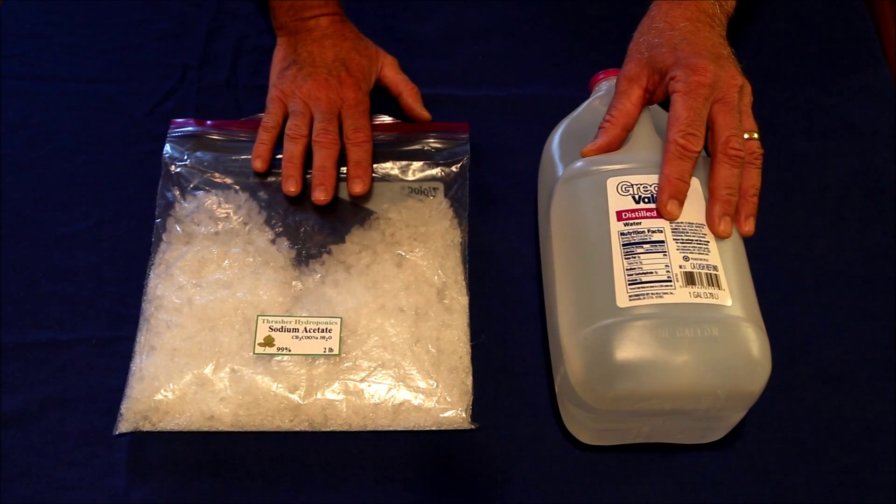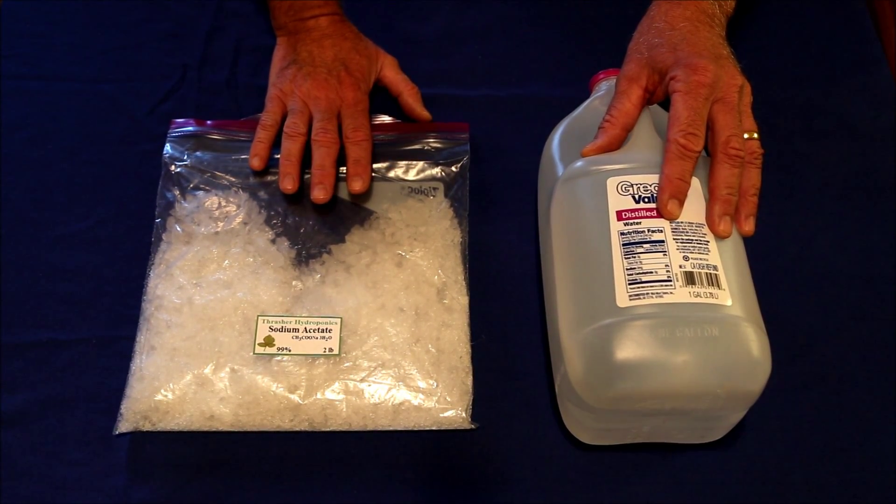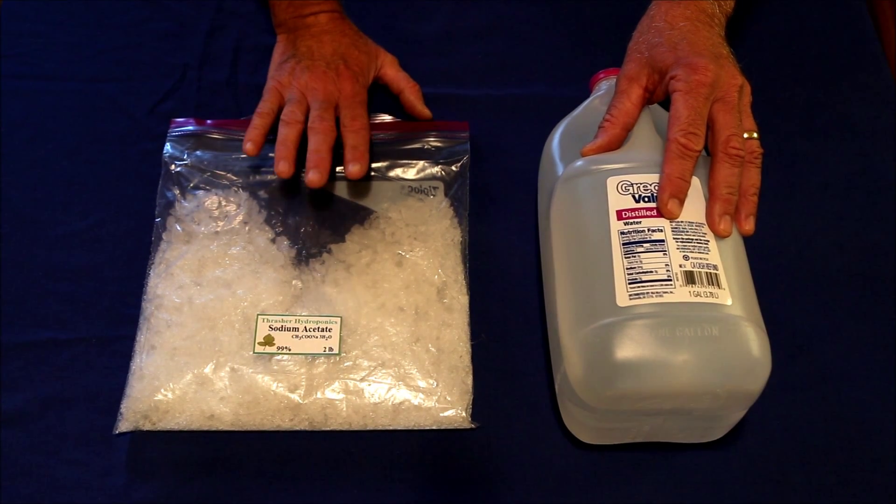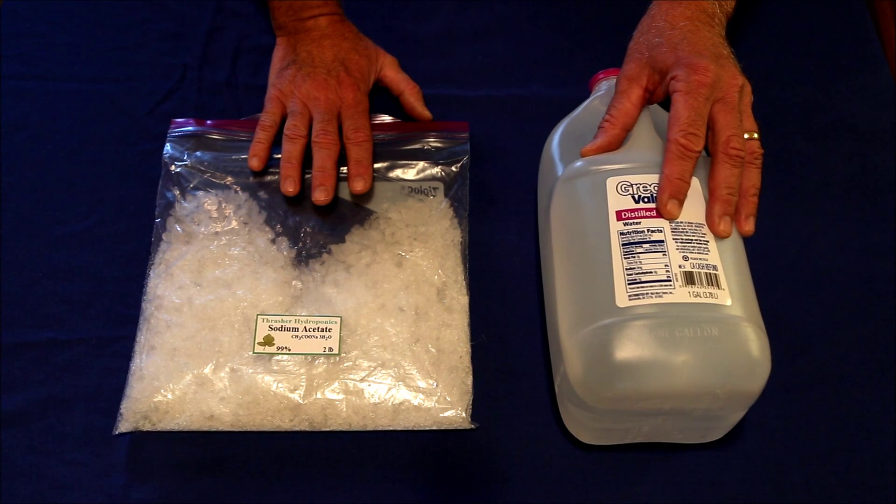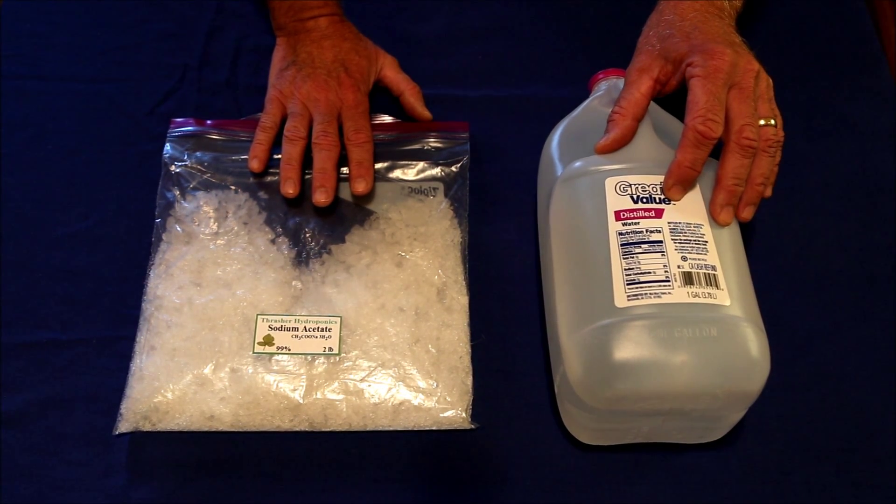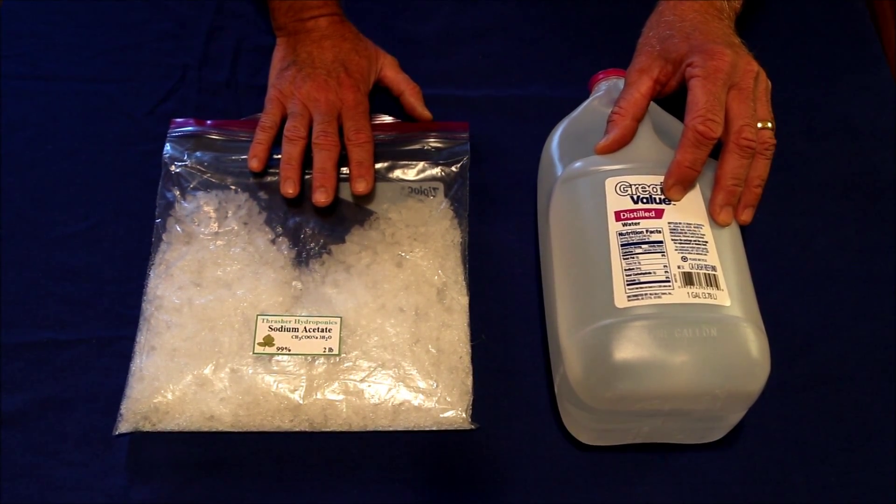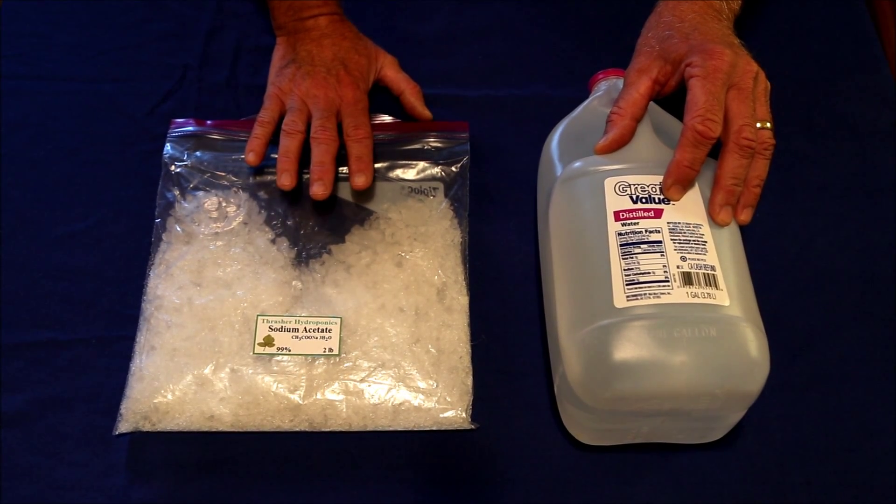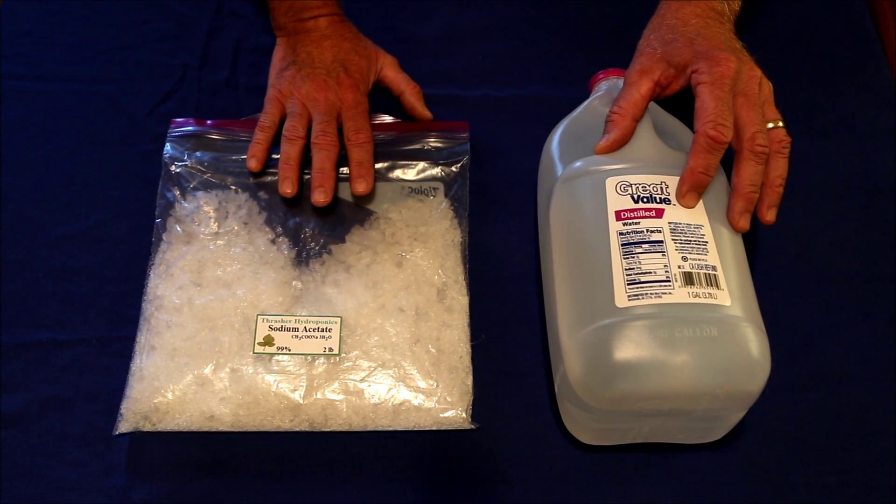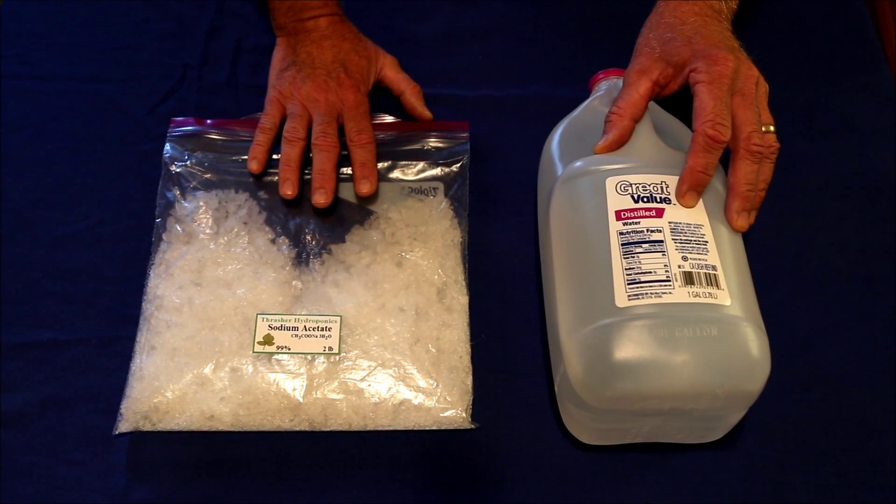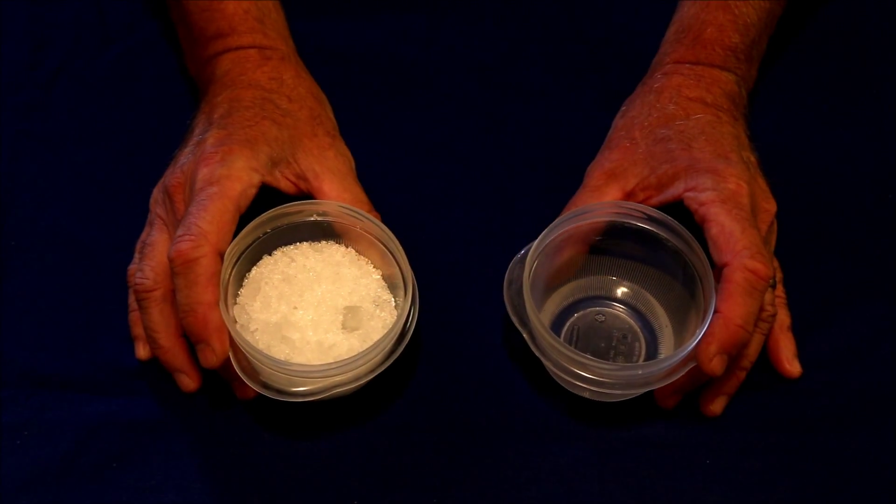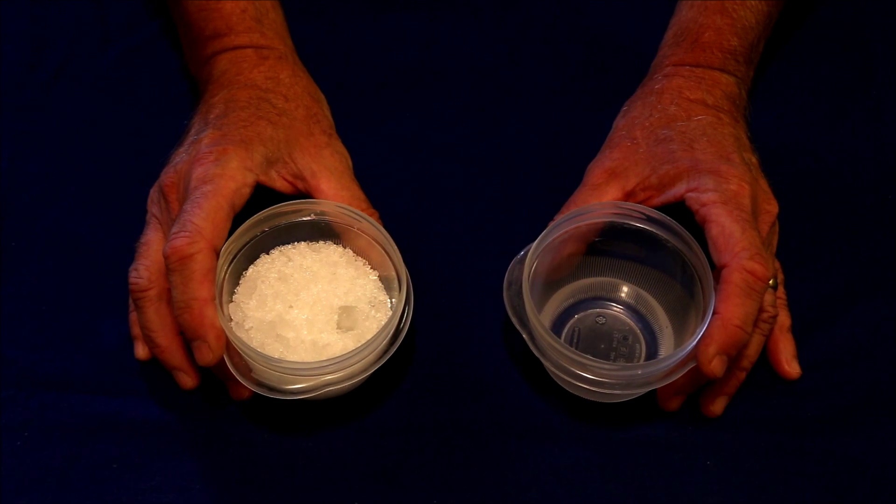The amount of sodium acetate to mix with the water depends on how fast you want the crystals to grow. At a 2:1 ratio—twice as much sodium acetate by weight to water—they'll grow very slowly. At 5:1, they'll grow so fast it's hard to follow the progress. Tailor the concentrations to your particular needs. Pre-measure the water and sodium acetate you want to mix together.